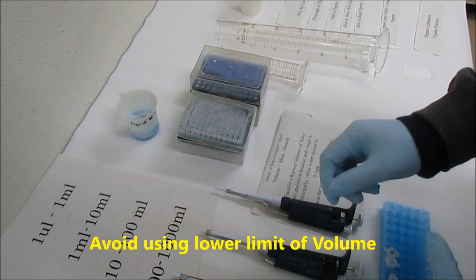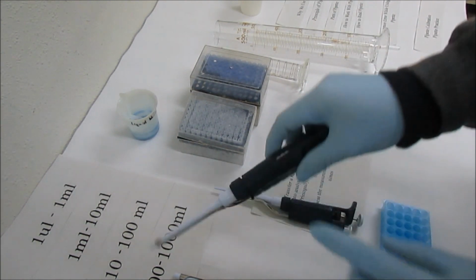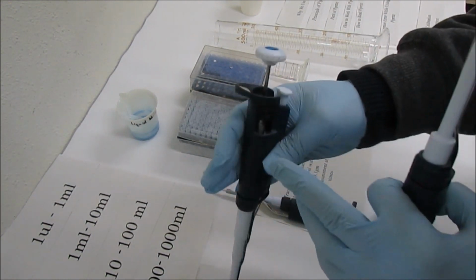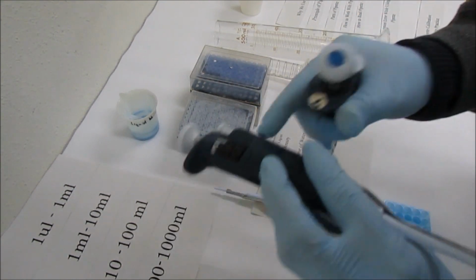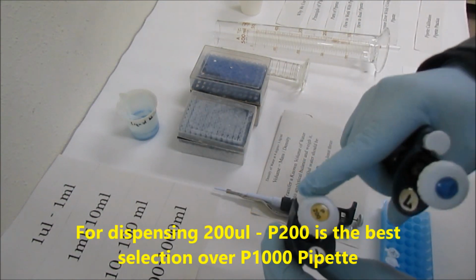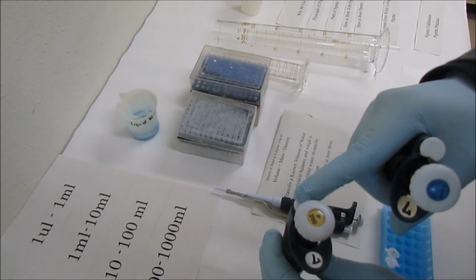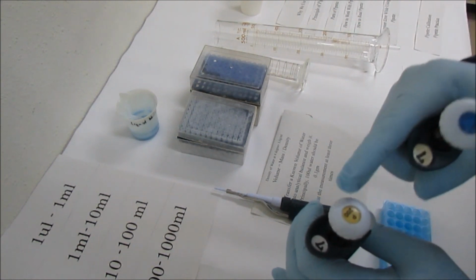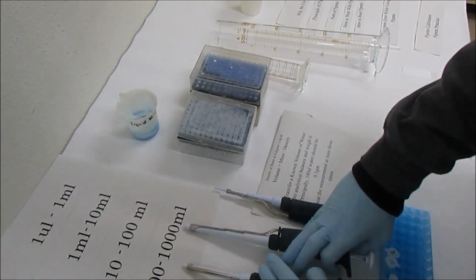Suppose you want to measure 200 microliter. This is the maximum limit, 200 microliter, and for this pipette 200 microliter is the lowest limit. So this is the best pipette to use for 200 microliter. Always use a pipette of large volume or maximum volume.